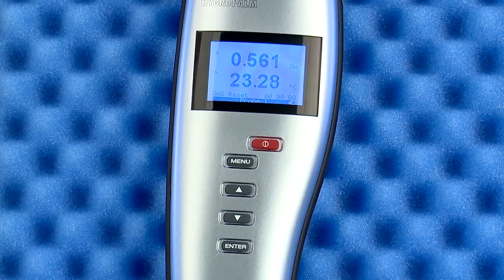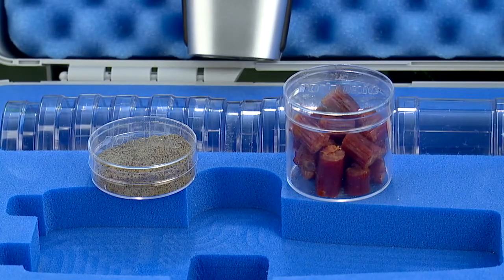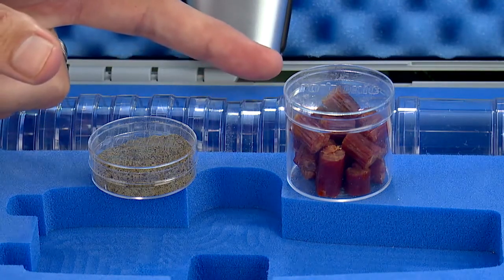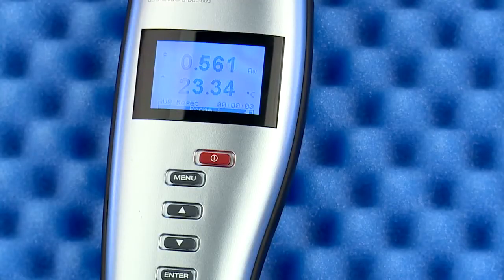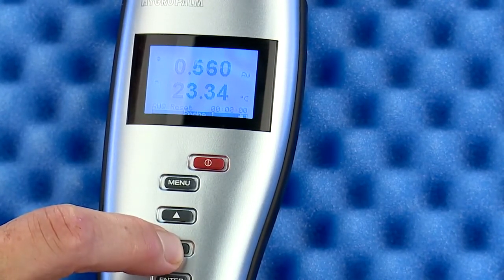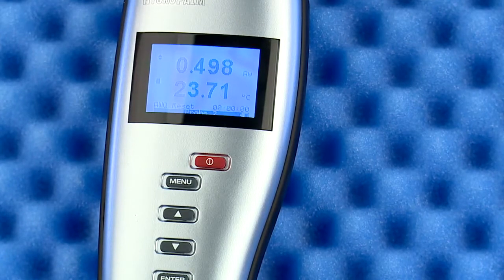Now onto your first AW measurement. As you prepare your samples, consider which sample cup size is right for your test sample. Powders, liquids, and fine grains are perfect for the small sample cup, while larger and chunky samples fit well in the large cups. As you can see from the instrument setup, two probes can be connected to the HP23 at the same time. Switching the display between the two probes is as simple as pressing the up or down button. When using two probes and performing AW measurements, starting a test starts both probes at the same time, so make sure to have both samples ready.